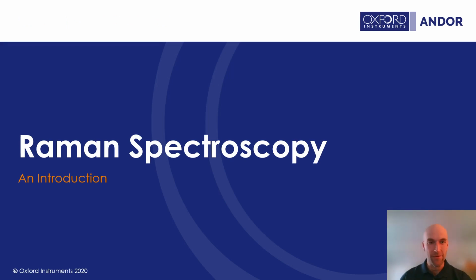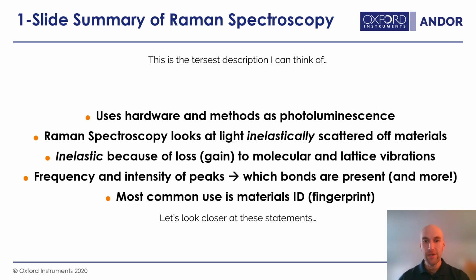So without further ado, day one of my short course. Very quickly, and if you're only going to stick around for a few minutes for this course, I just wanted to give the elevator pitch for Raman spectroscopy. What is a one-slide, minimal, terse description of Raman spectroscopy? Well, it's an optical spectroscopy method that uses similar hardware and methods as photoluminescence.